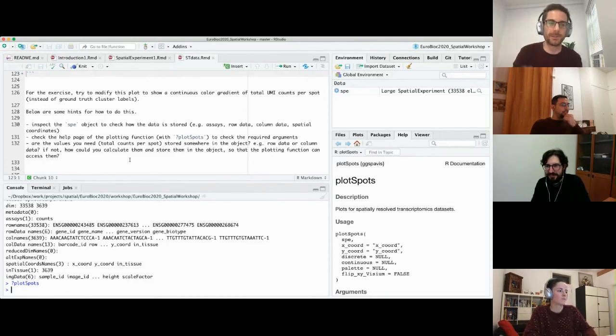But then if you're looking for the solution, go and find the RMD version on the GitHub, and you'll find it there at the end of this script if I scroll further down. I'm just looking at the top of the list now.